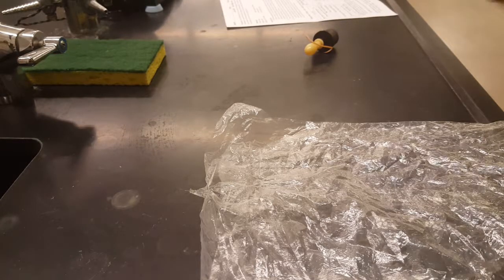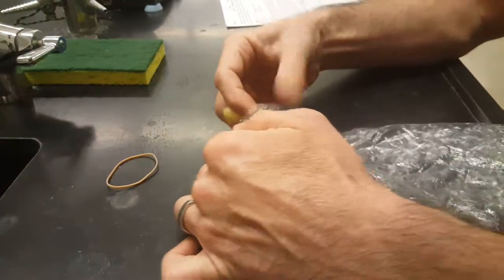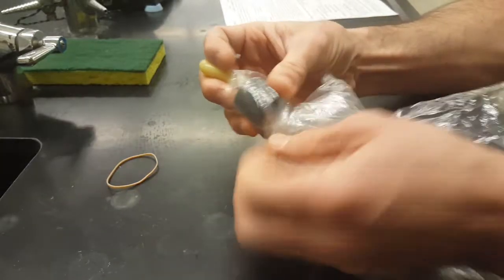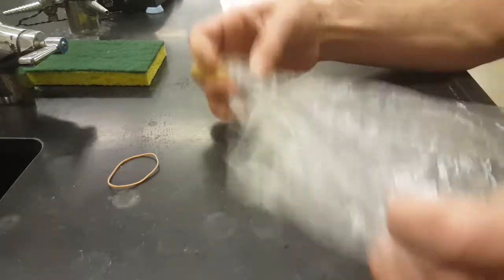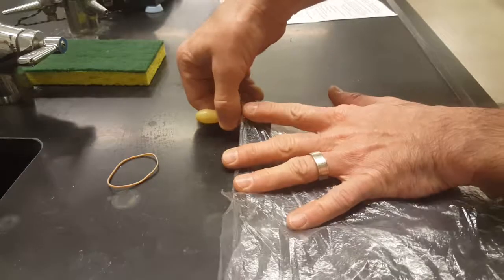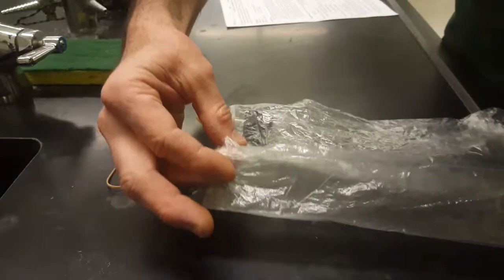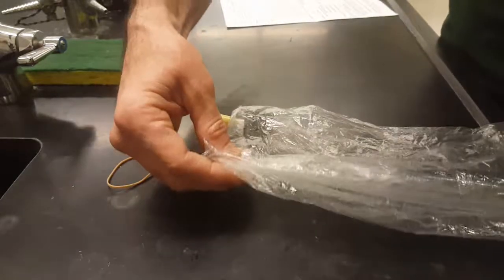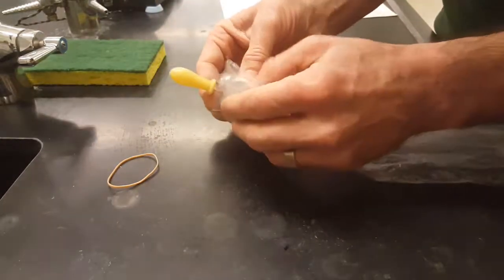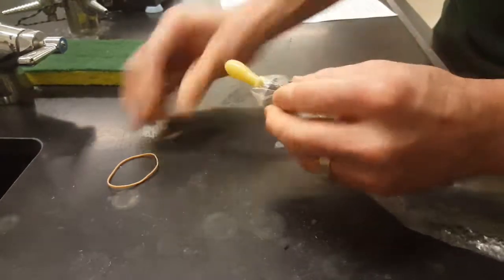One of the hardest things about this lab is getting your stopper in the mouth of the bag in a way that doesn't choke the end of the stopper. It's easy to wind this up really tight, and then air won't flow through there. So the method I use is an accordion method, where you put the stopper in the side of the bag and then fold the bag about an inch, inch and a half, and then fold it the other way, in an accordion style. So you're zigzagging and zigzagging. When you get close to the stopper, push it up against the stopper like that. You want to be able to see the hole in the bottom of the stopper.